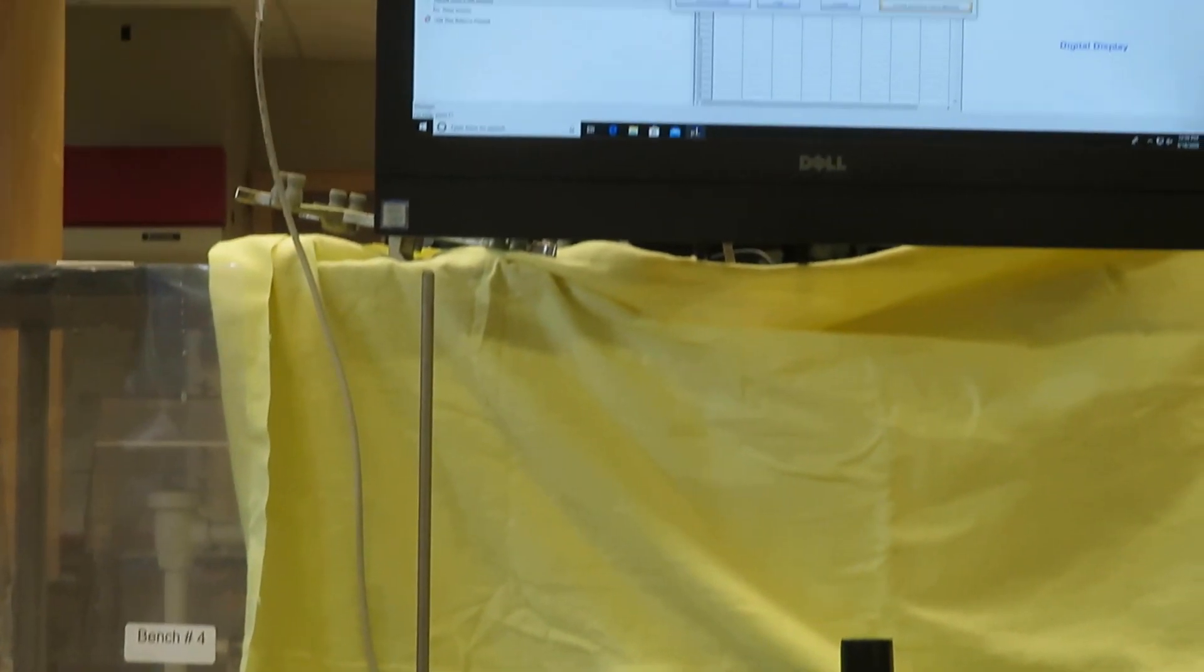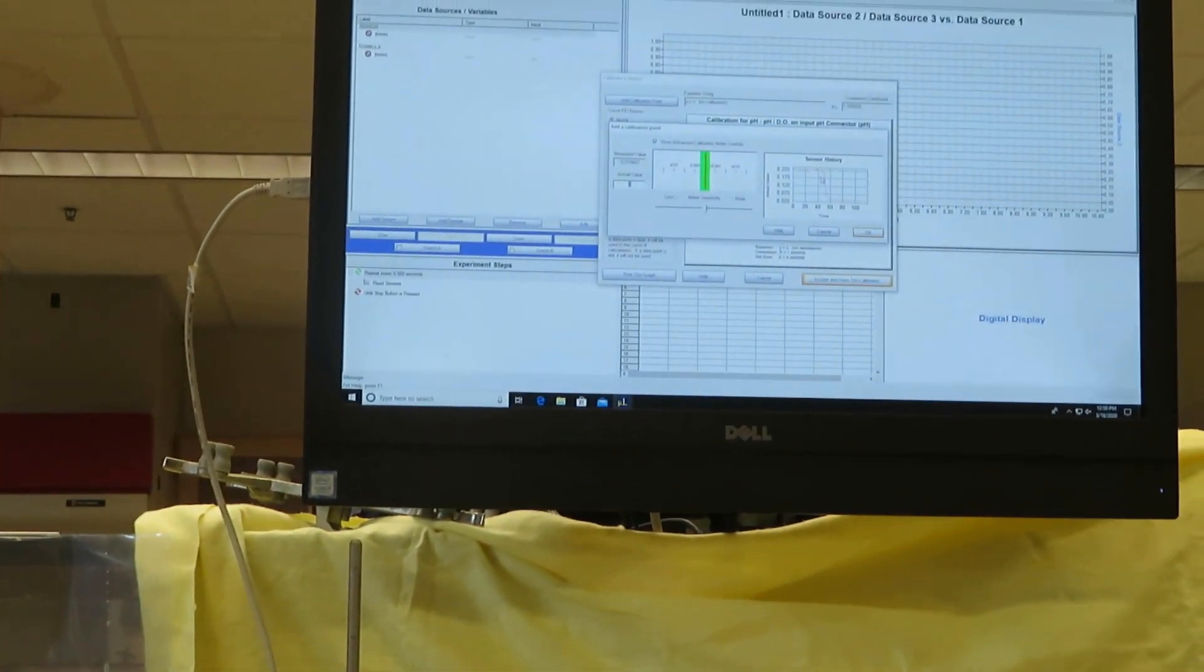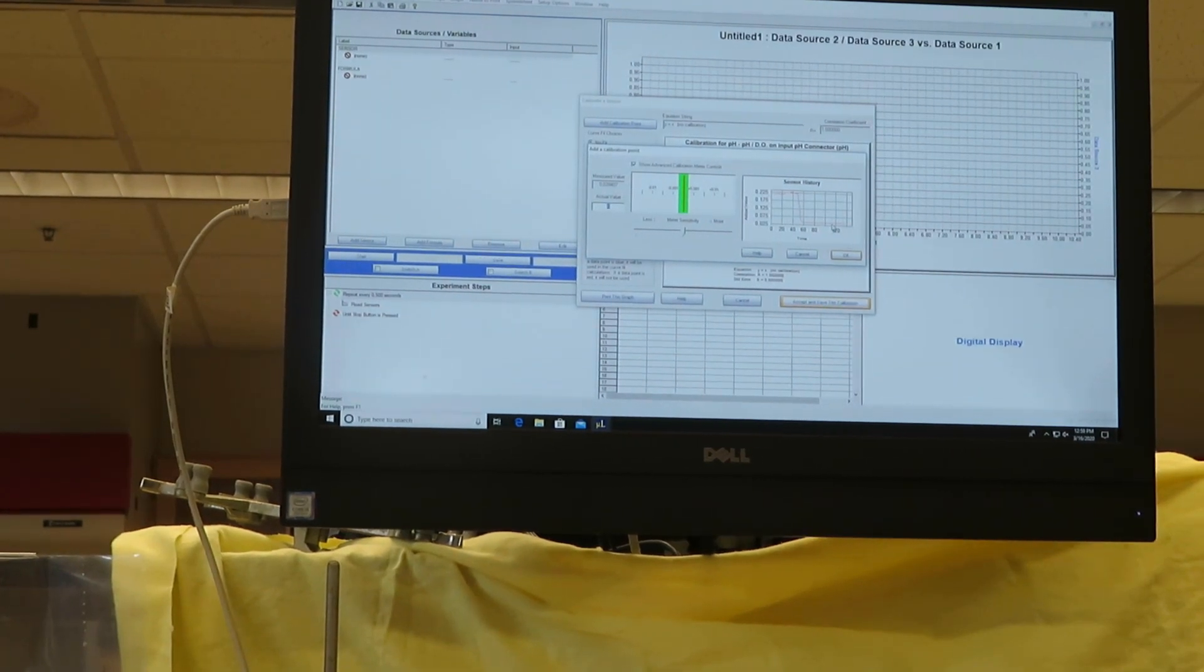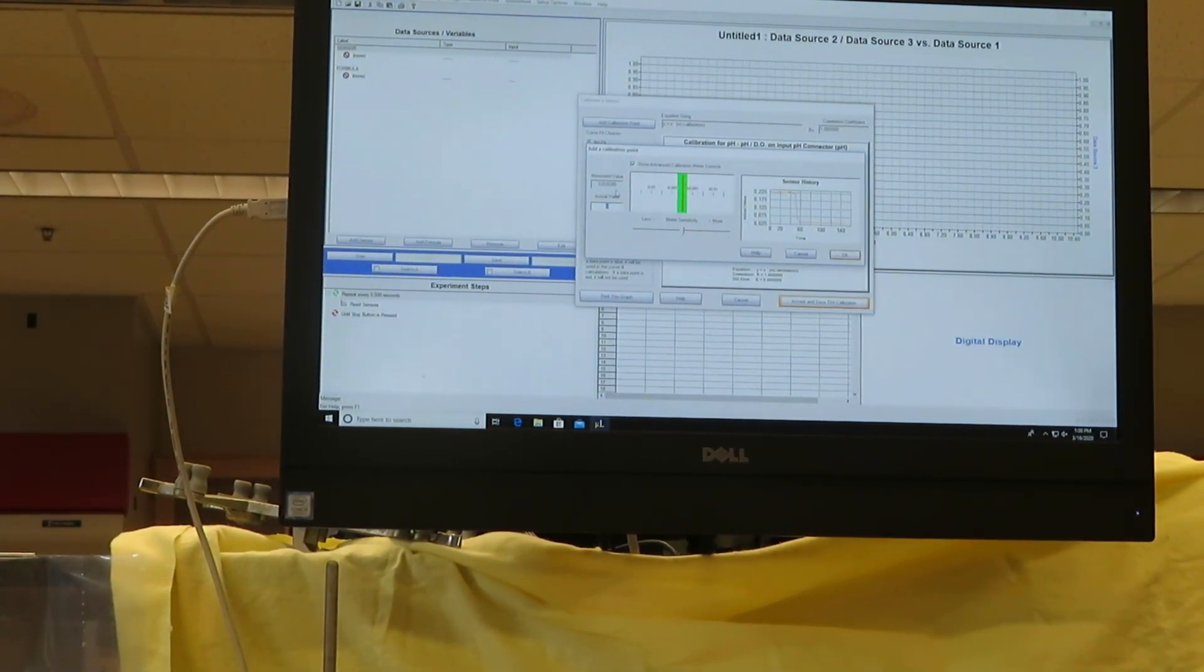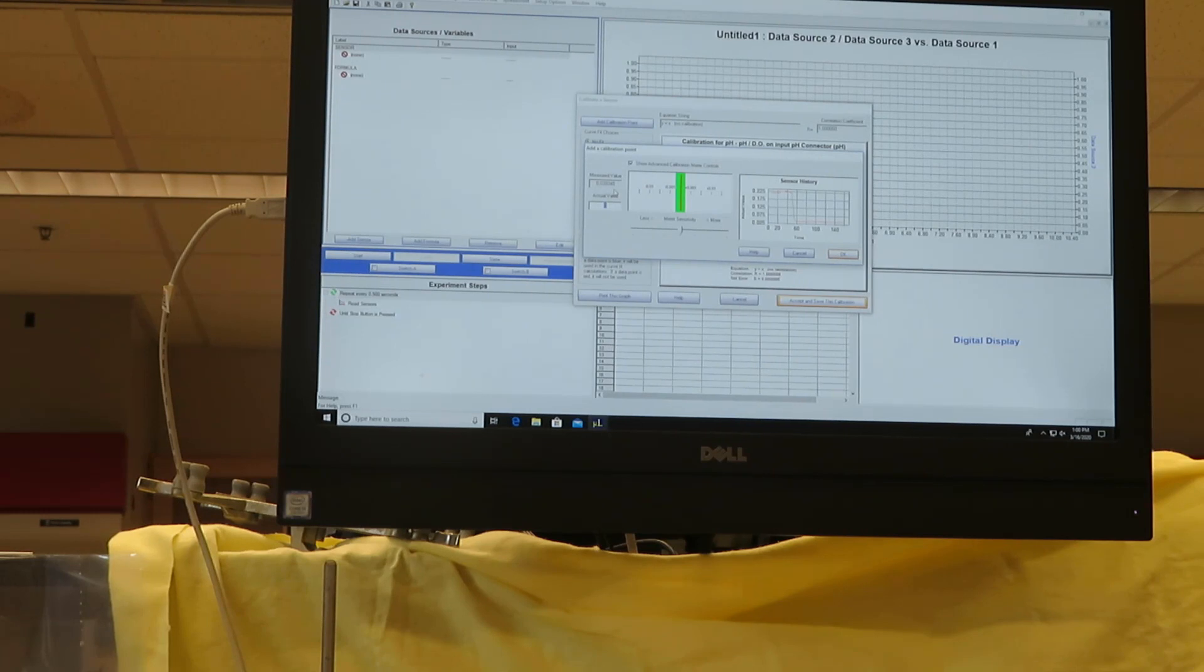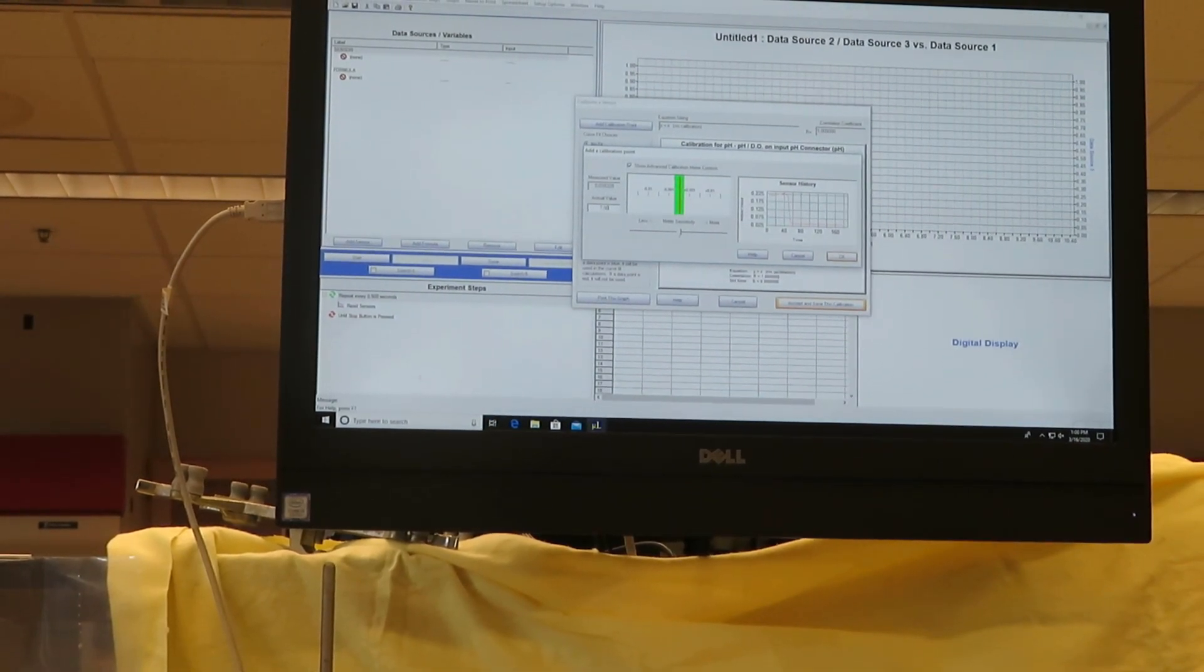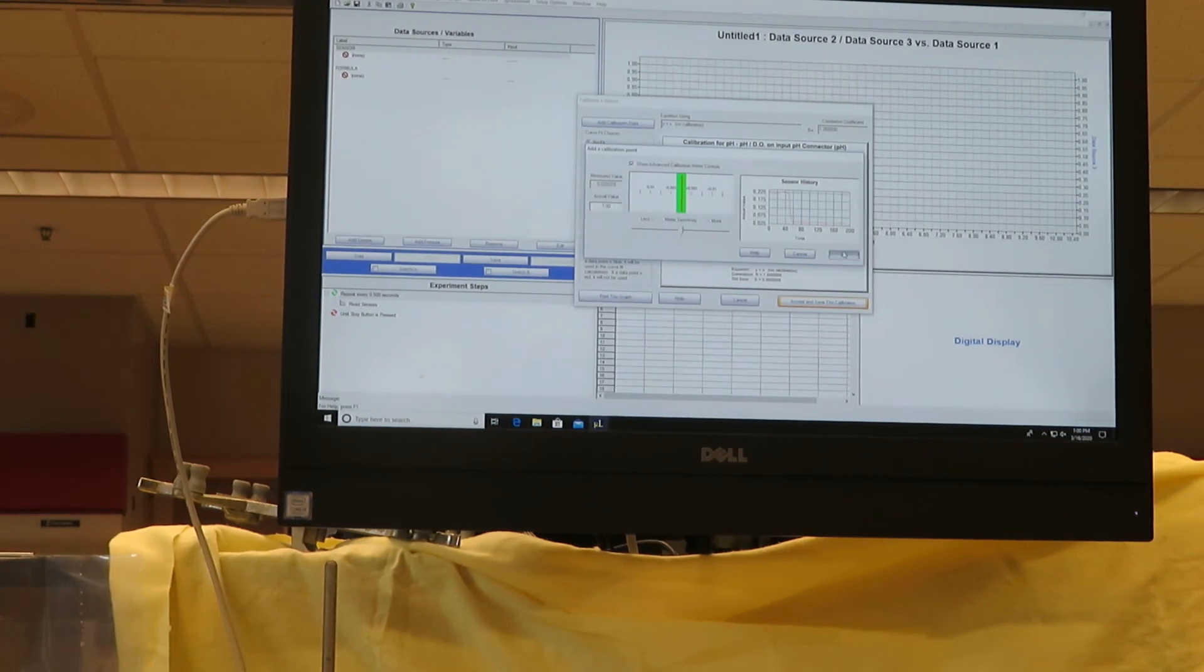As you can see on the screen, there's been a dramatic change in the voltage because we're at a different buffer solution. It seems to have leveled out, so I can enter the value 7.00.